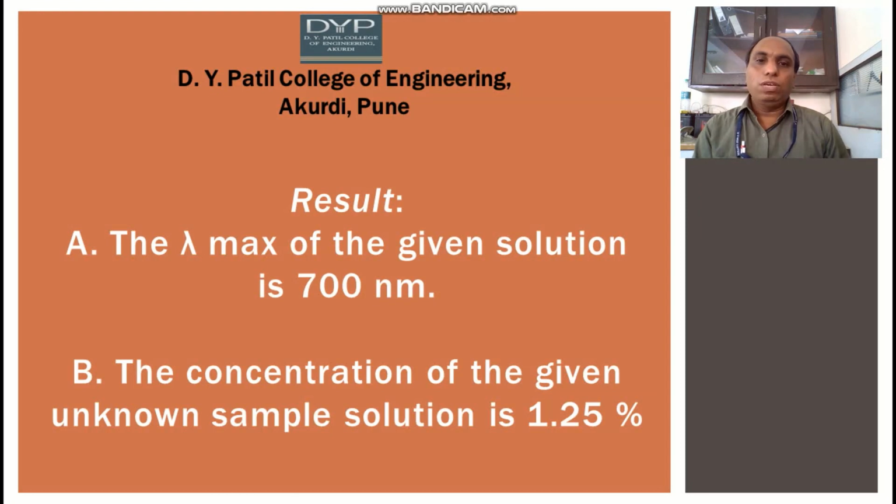So in this way we can verify Beer's law, determine the maximum wavelength of absorption, and determine the concentration of the given sample.